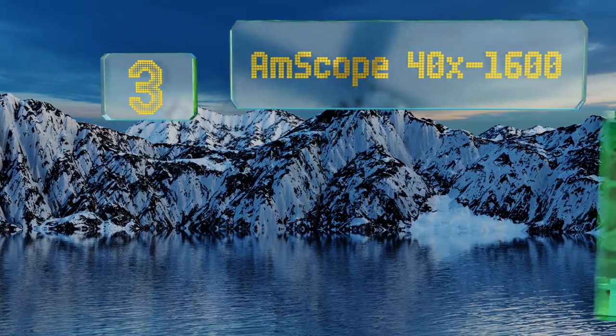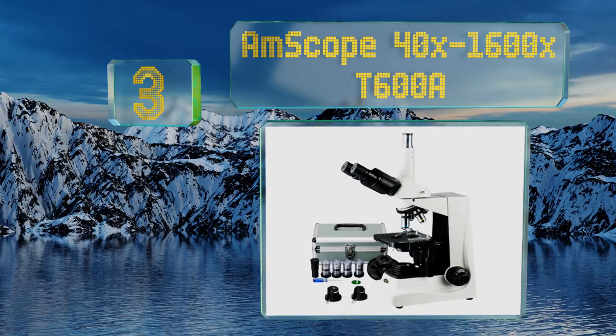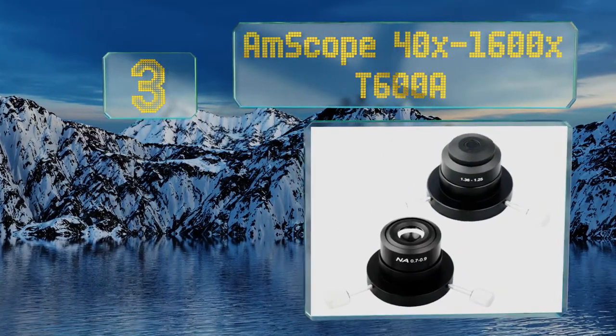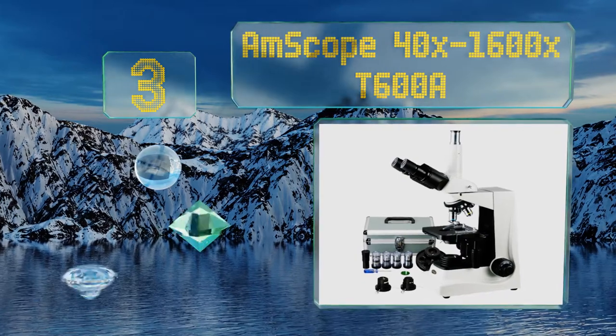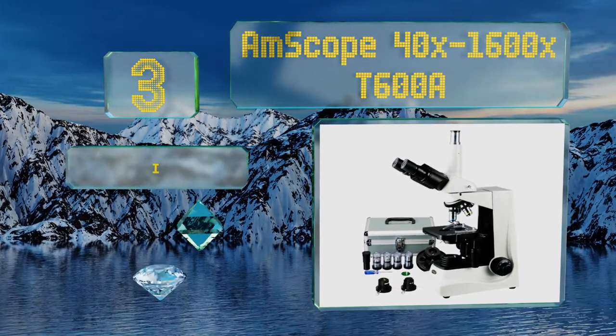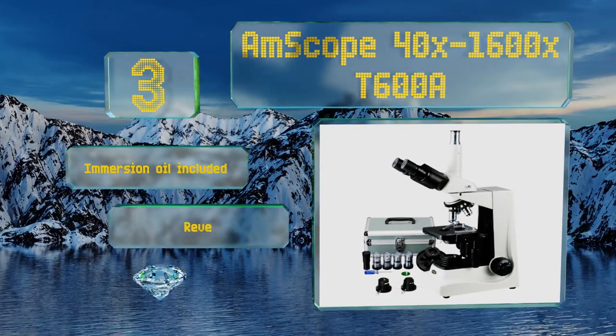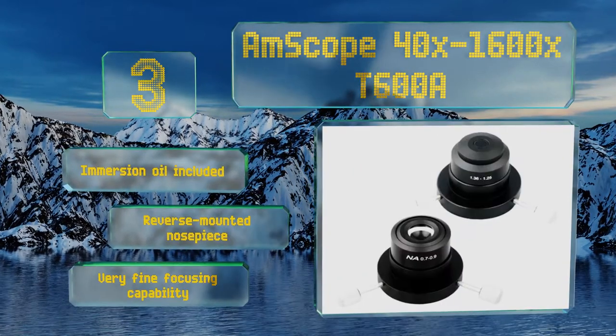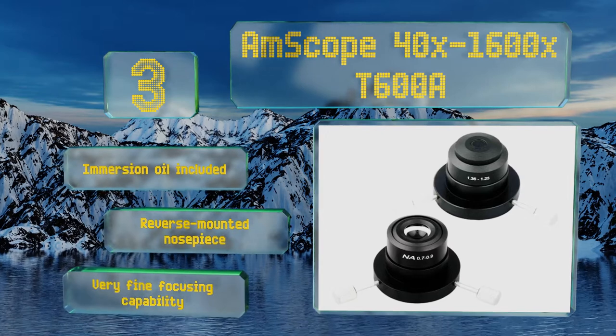Halfway up our list at number three, the AmScope 40x to 1600x T600A is one of the better dark field models on the market, giving you the ability to observe specimens that would transmit too much light in a bright field setting. It comes with four condenser elements offering varying magnifications, includes immersion oil, a reverse-mounted nosepiece, and very fine focusing capability.